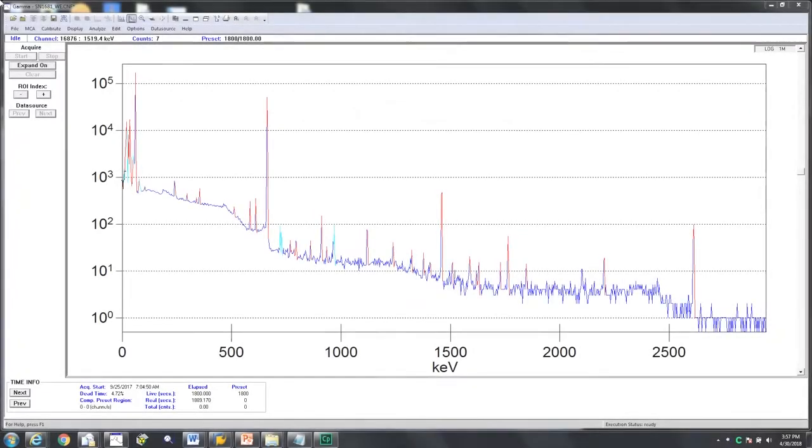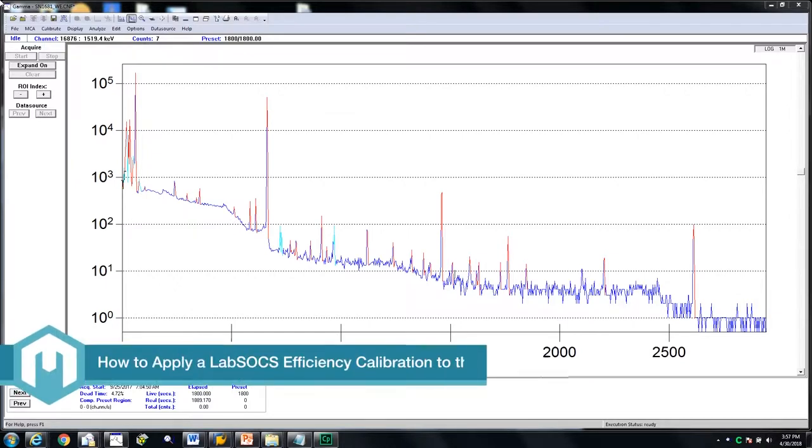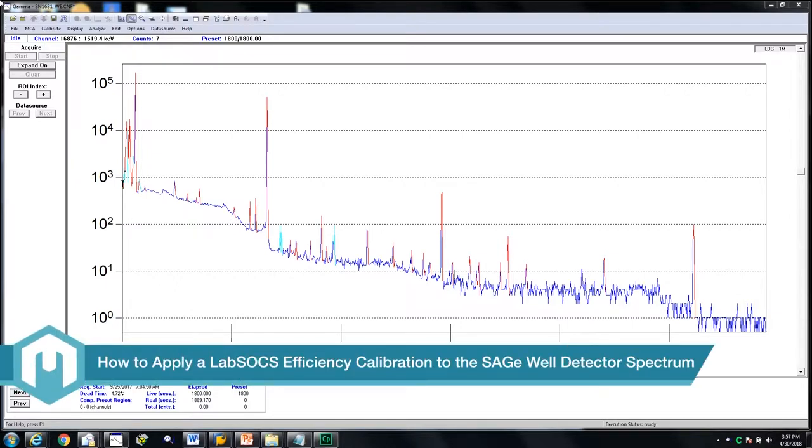In this Mirian do-it-yourself video, we will show you how to apply a LabSox efficiency calibration to the Sage Well Detector spectrum.